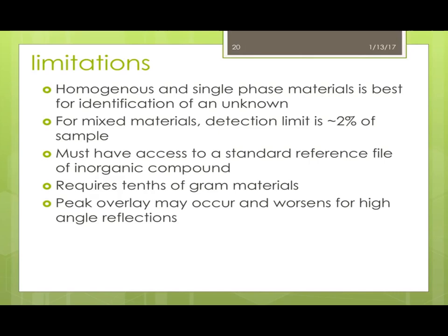Other limitations for this process are that a sizable amount of the material is needed in order to run the test. So if you don't have very much of your sample, it will be a challenge or impossible to run XRD. Lastly, if the sample is being run at high angles, there may be peak overlap, which causes inaccurate peak profiles.